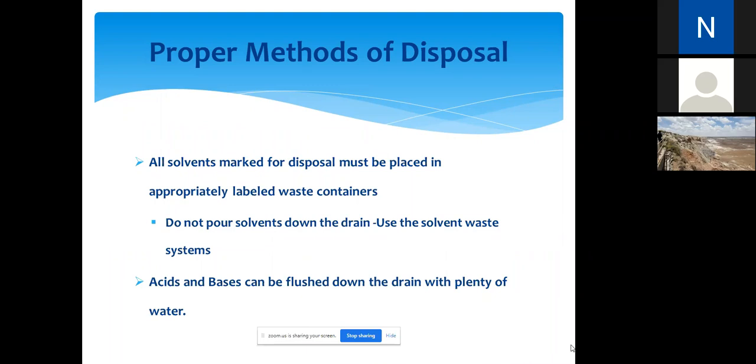And we also have the different jars of acids, because if you have to throw away an unused acid, hydrochloric acid or nitric acid, if you have 2 mL of it, you can't just throw it down the sink. You have to dilute it first, neutralization, before you throw it in the sink.